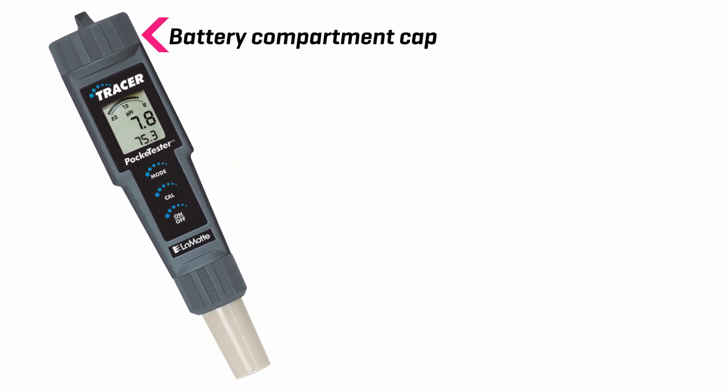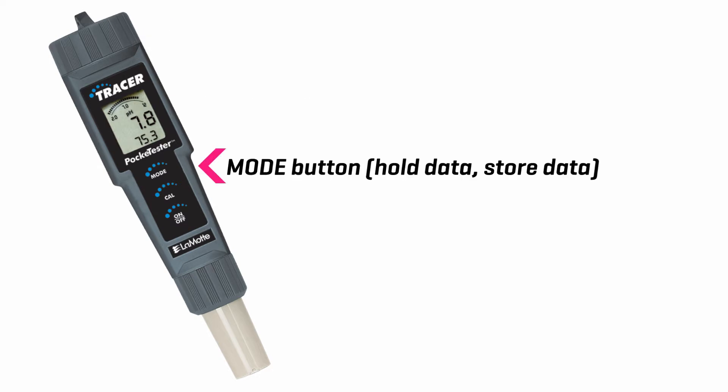Battery compartment cap. LCD display. Mode button. Hold data. Store data.